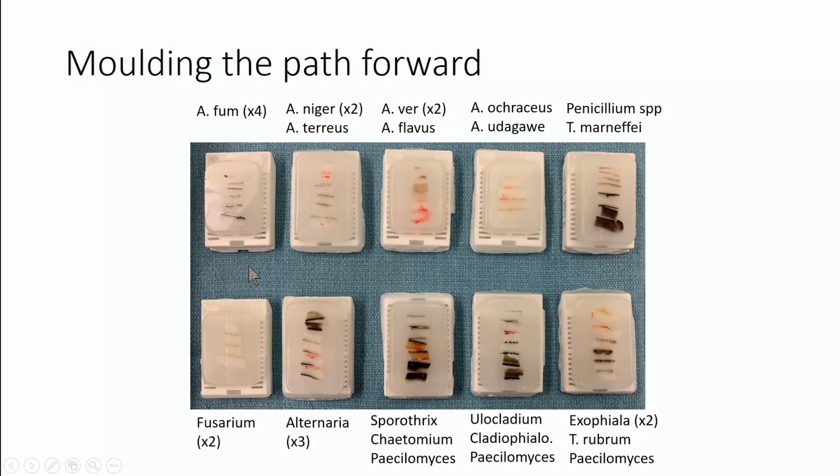assay. I will also say it is really challenging to cut FFPE tissue. So for residents, be kind, cut your sections thin, and remember that this is hard, so appreciate your histopathologists. You may be able to see that these have been cut, and so we have slides, we have probes in-house, and we're getting going on that project.